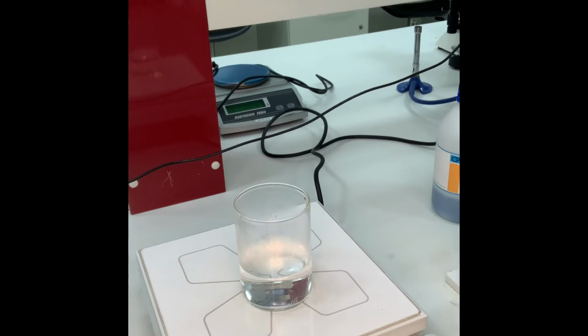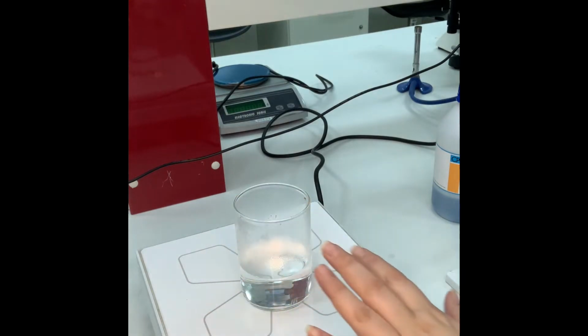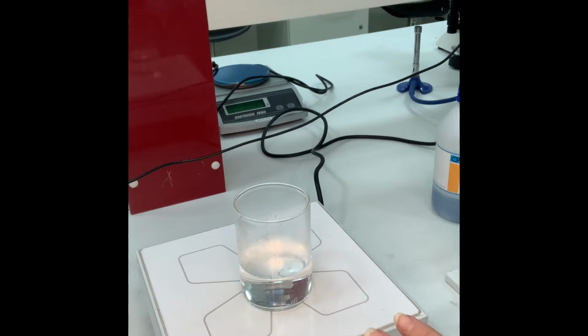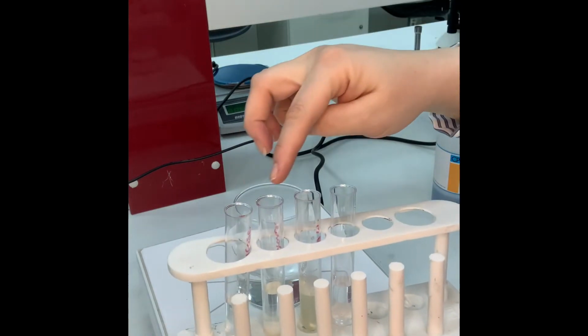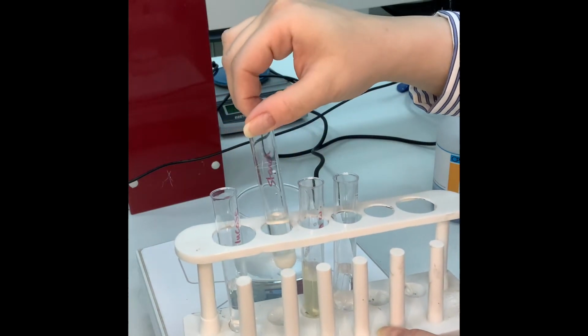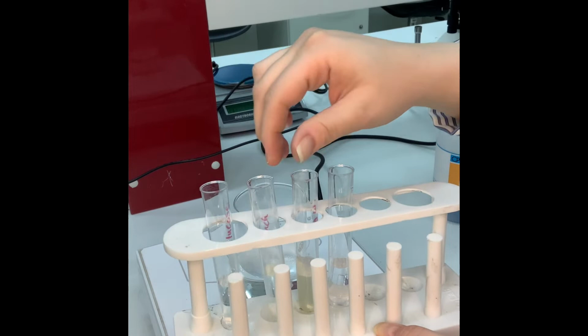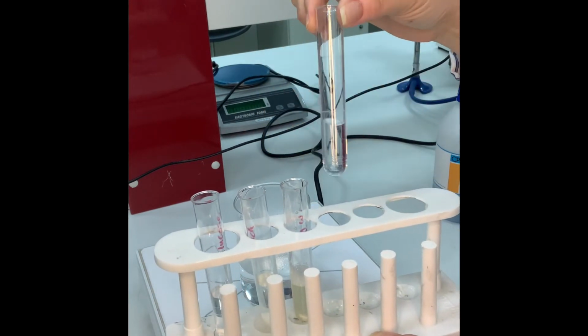So this is mainly the practical. As you can see, this is a Clifton plate. It's a heater. This is the beaker where I keep the water, to heat the water, to use it for my reduction, the heating part. Over here, as you can see, I have 3 test tubes: glucose solution, starch solution, both labeled, egg white, and I have my negative control, the water.